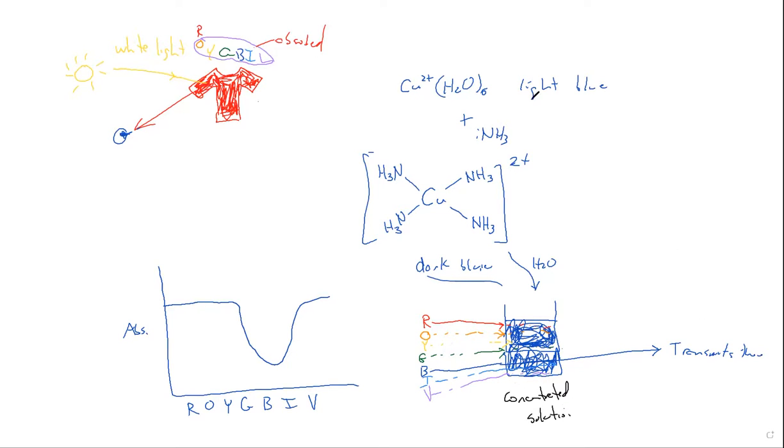Now, if I take a dilute solution of the same stuff, so it's not very concentrated. I'll put it in a beaker right over here. Make sure I make my beaker long enough this time. I want to move it over a little. So if I put a dilute solution, let's see what color the dilute solution is. I'm not going to make the color yet.